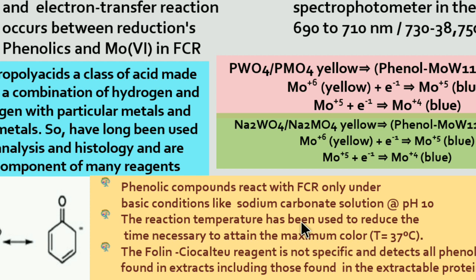Here in certain papers and also in certain kits provided to perform these FCR reagents for the lab and also for the colleges, it has been seen that without the use of the reaction temperature, which will be mentioned in the kits, it is going to lead to about 120 to 180 minutes for the completion of the reaction.